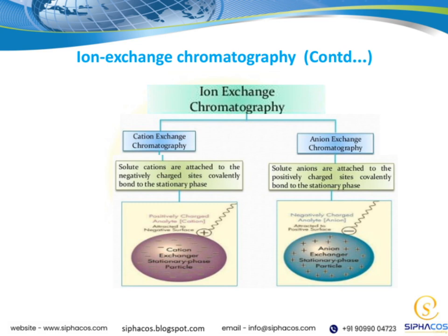Connecting this to our overall theme, ion exchange chromatography is fundamental in biochemistry and molecular biology, because it allows us to purify proteins, nucleic acids, and other biomolecules with high specificity. Understanding these key points helps us appreciate how this technique fits into the broader context of analytical and preparative methods.